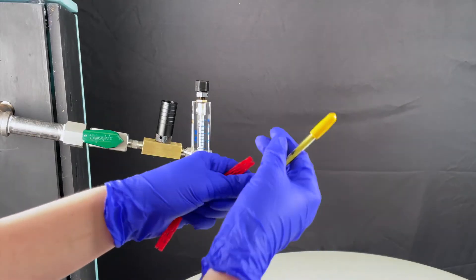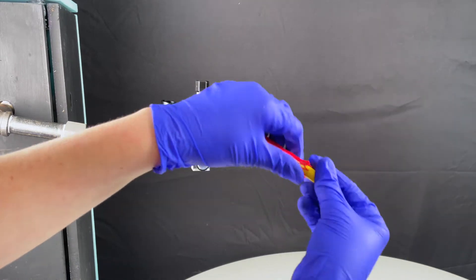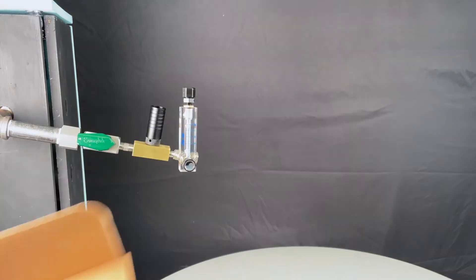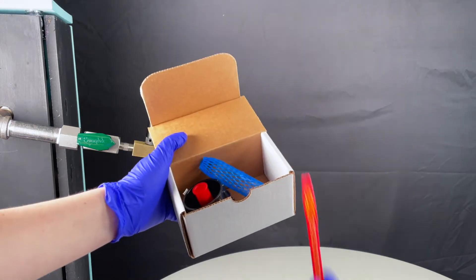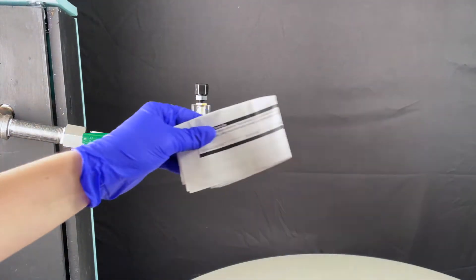Replace the netting on the source bottle and detector tube to avoid breakage during transit. Then place your 47 millimeter filter, source bottle and detector tube in the sampling media box with your completed data sheet.